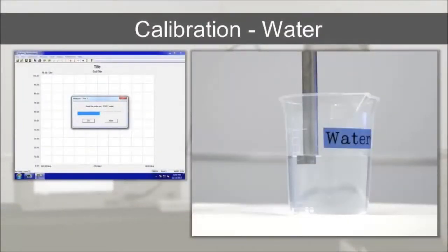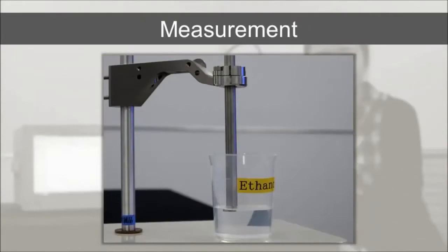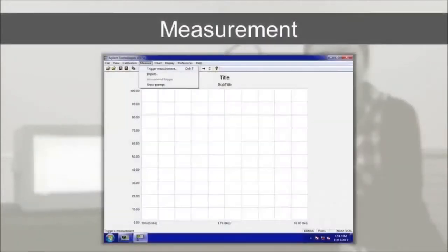Now we can measure the sample. Let's measure ethanol. Click measure, trigger measurement.